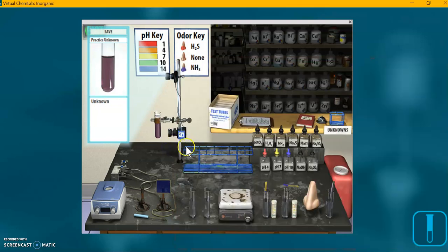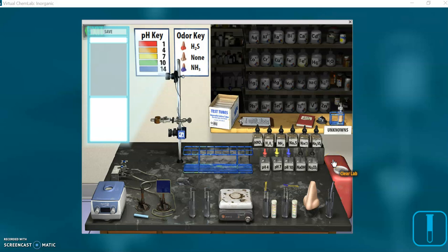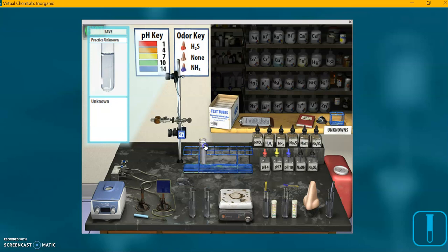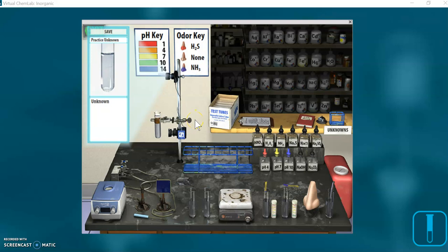I'm done with that — clicking to close the lab book. I'm going to click the red disposal bucket to clear the lab away. Right away, a new practice unknown is created to the same parameters as the previous one — it could have zero to three of those same three ions. In this way, you can do as many practice unknowns as you want until you get them right each time. When you feel you have a grip on it, you can go on to the next part, which is the actual assigned unknown — step 10 on your worksheet.